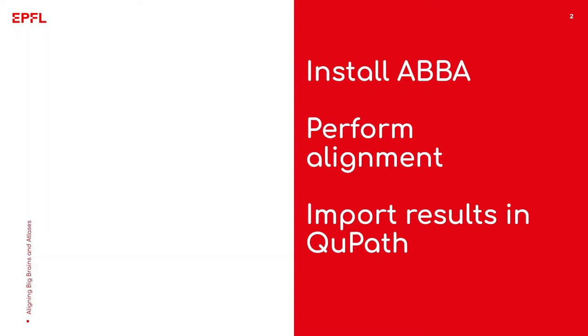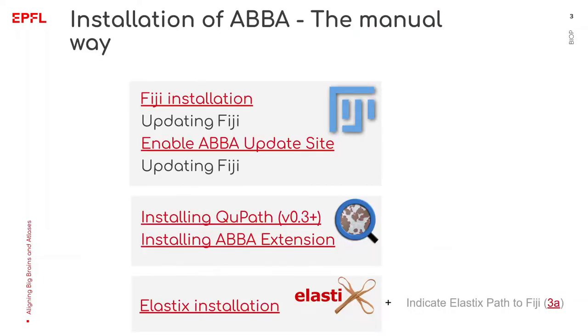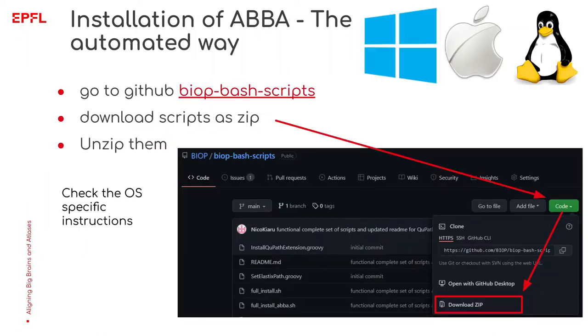Let's get started. Installing ABBA means installing three different software: Fiji, QPath and Elastix. You also need to download the Atlas dataset and some plugins for QPath and Fiji. Installing all these components manually can be tedious and that's why I've made an installer script which automates all of this for you.